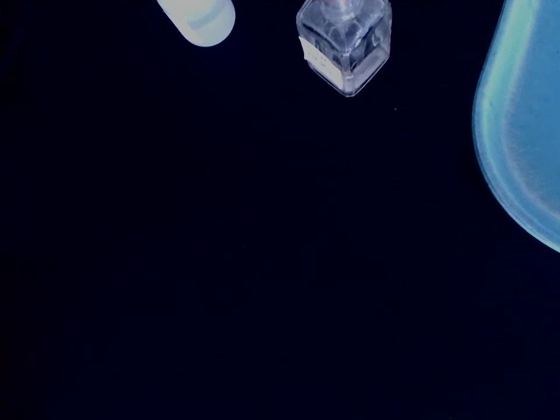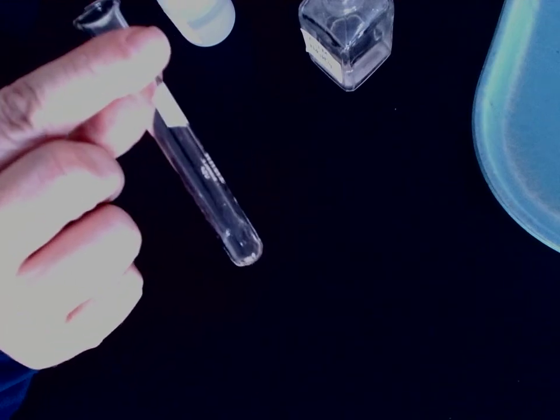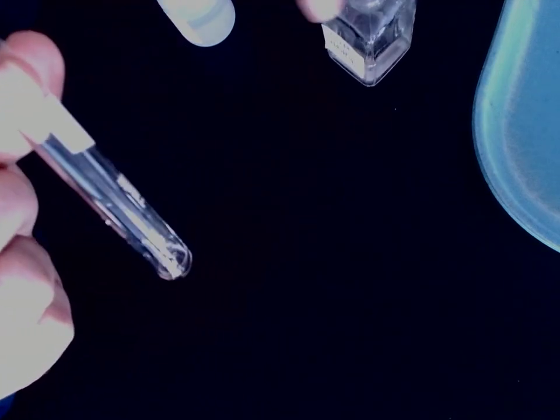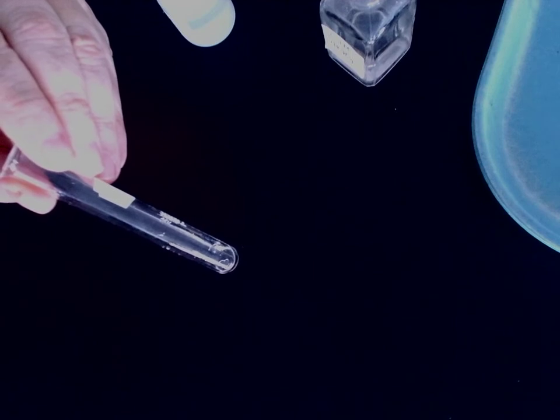On to the second to last row — we're going to be working with sodium phosphate. There's the sodium phosphate. The first one we need to mix with is zinc nitrate.